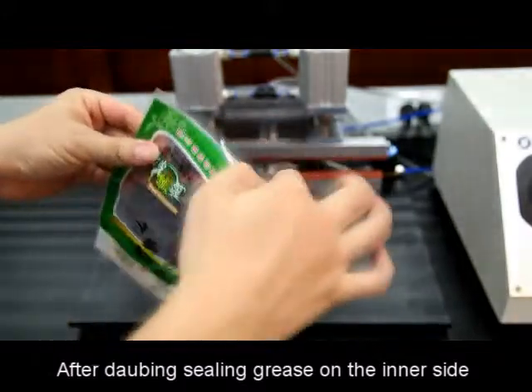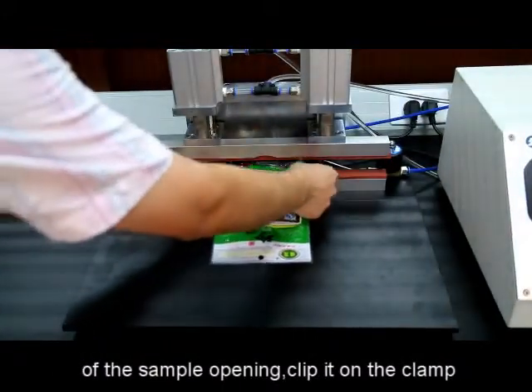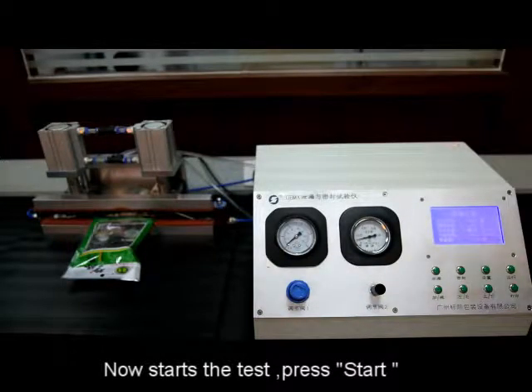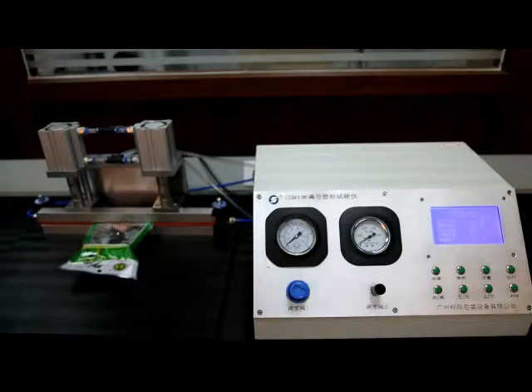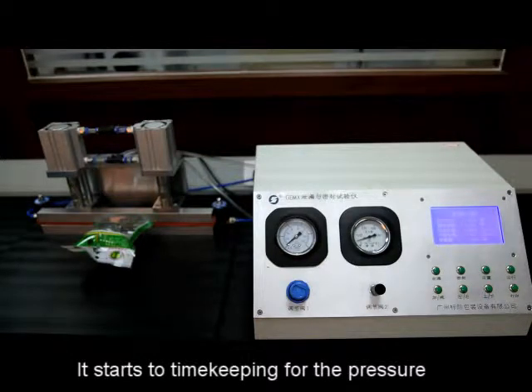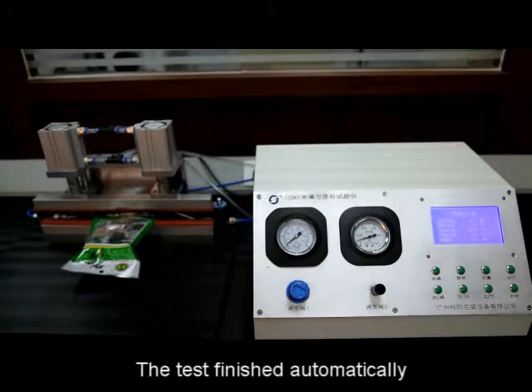After applying sealing grease on the inner side of the sample opening, clip it on the clamp. Now start the test — press start. It starts timing for the pressure. The test finishes automatically.